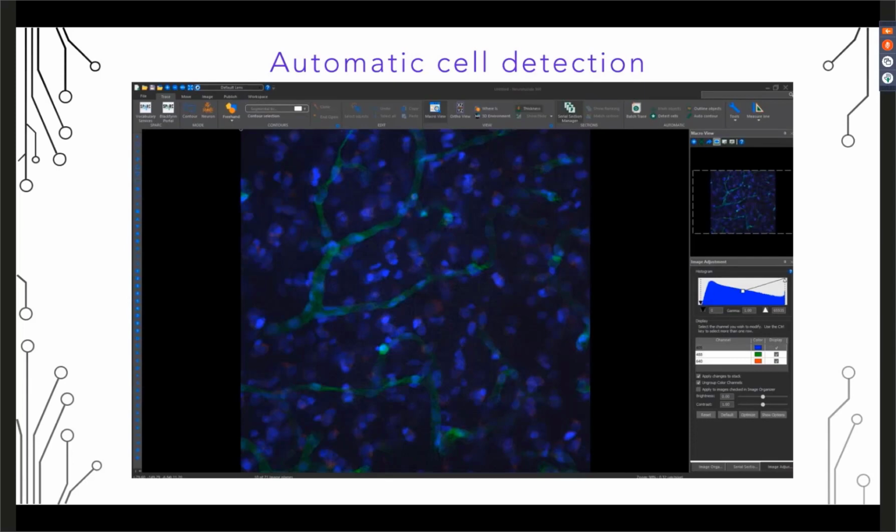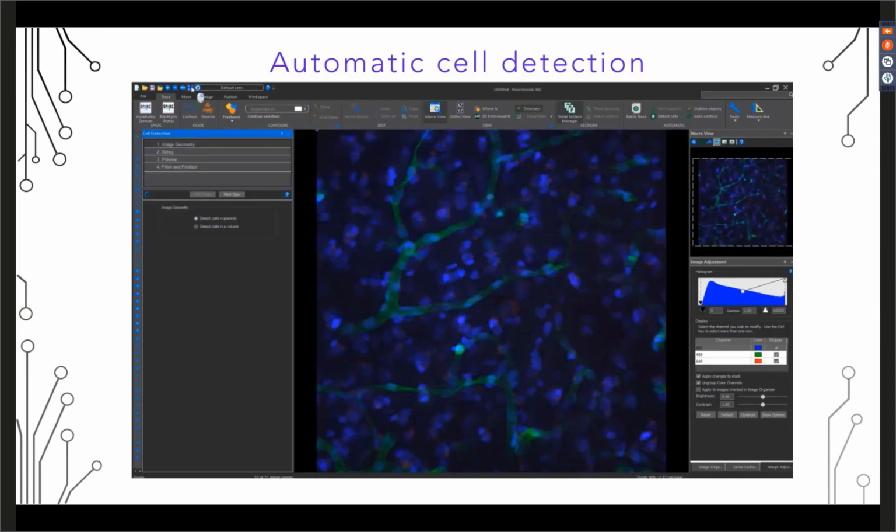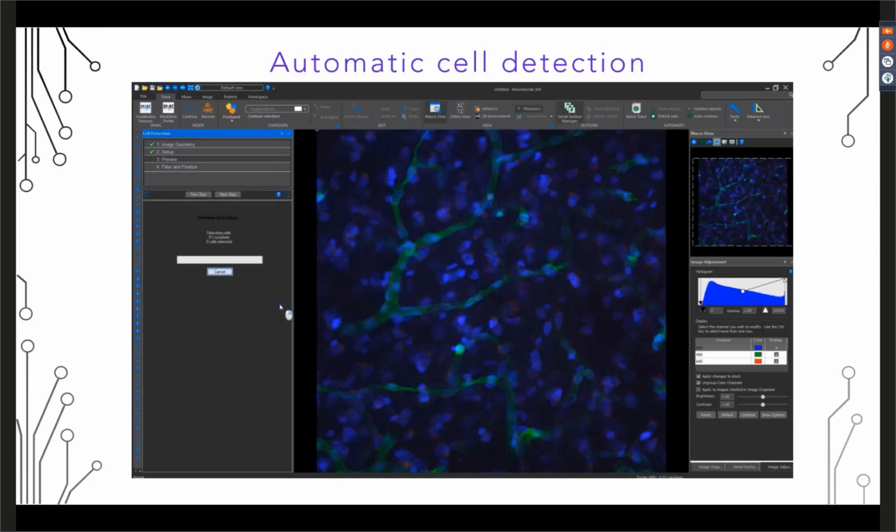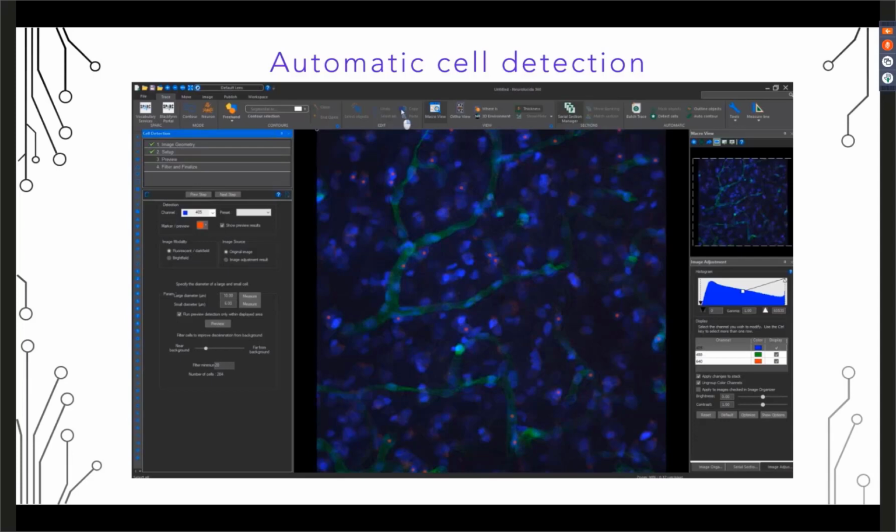Another segmentation tool that can be used to enrich your FAIR segmentation data file is the cell detection feature. To start, click the Detect Cells option and choose whether you'd like to detect cells in 2D or 3D volume. Next, choose the first color channel you would like to detect in. Filter the cells by size, choosing the largest and smallest cell diameters. Now, preview your marked cells on a single plane of the image. You can see them as red circles on the screen.